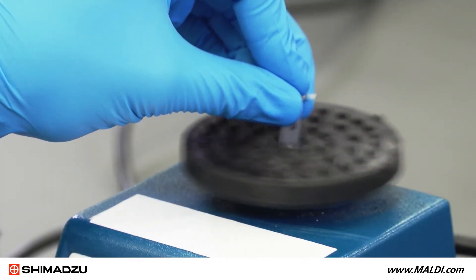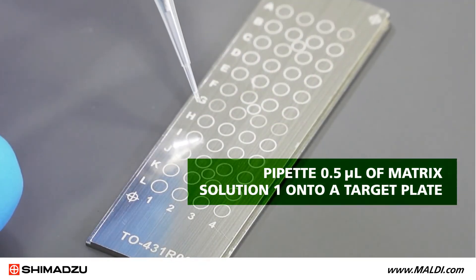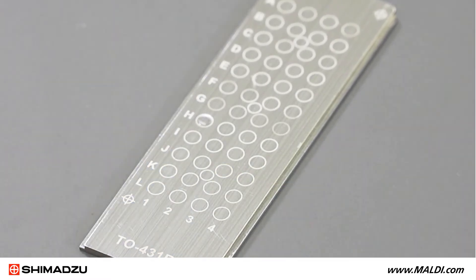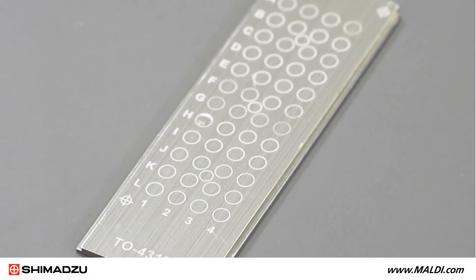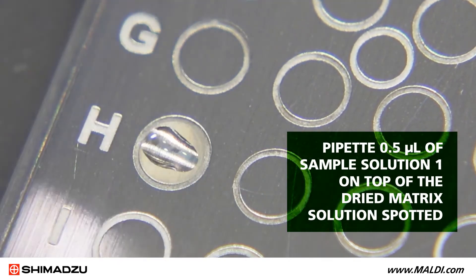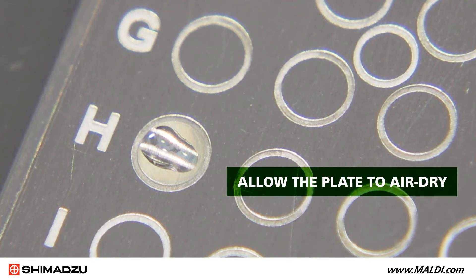Vortex this sample. Pipet 0.5 microliters of matrix solution 1 onto a target plate. Pipet 0.5 microliters of sample solution on top of the dried matrix solution spotted. Allow the plate to air dry.